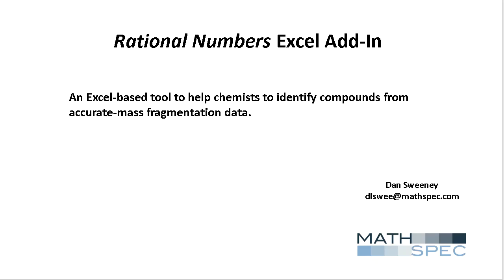I'm Dan Sweeney from MathSpec Incorporated. In this video, I will demonstrate how to use our Excel add-in to extract information from accurate mass fragmentation data, and I will briefly explain how this Excel add-in works.